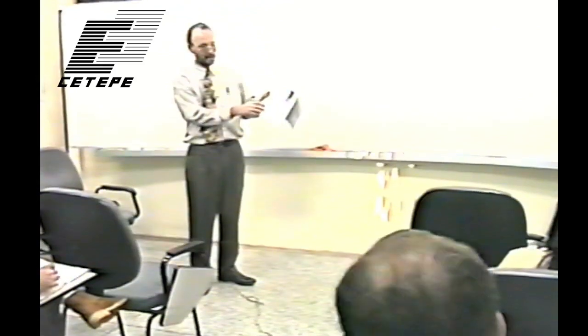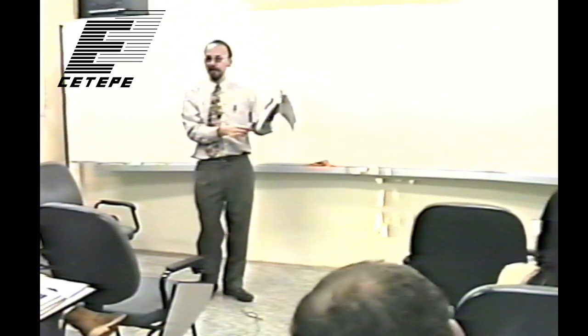And then the very important one for image noise, and we'll talk a little bit later about some of these contributors: structure noise, radiation noise, receptor noise, and quantum noise. Those are all very important effects. And noise, it's a constant battle between signal and noise that is really the dynamic tension that makes imaging so interesting. You're always trying to battle against noise.